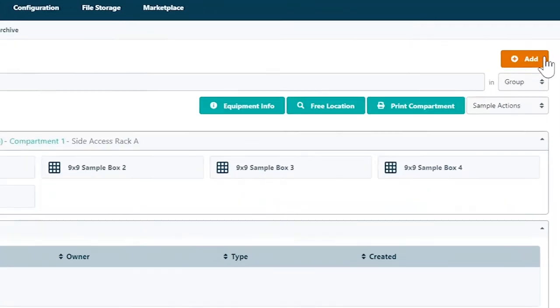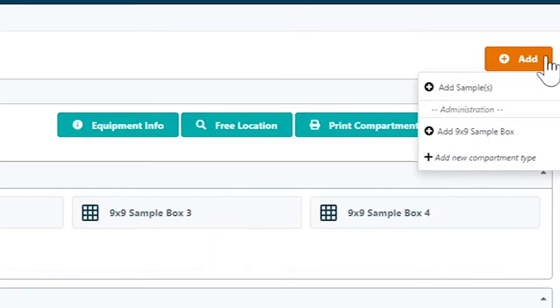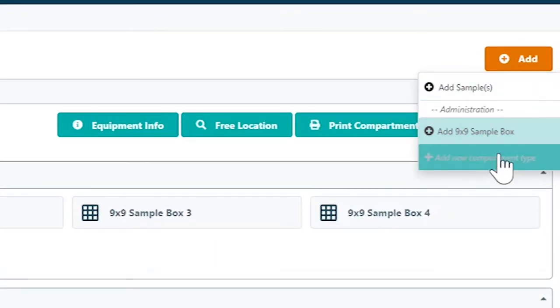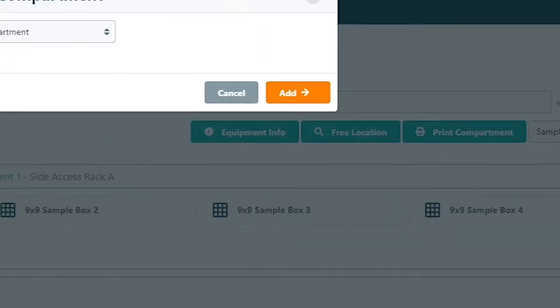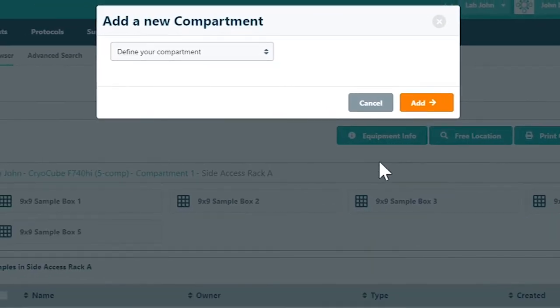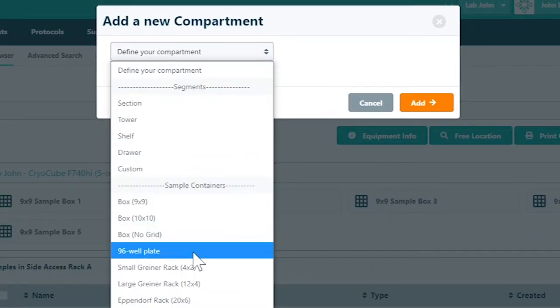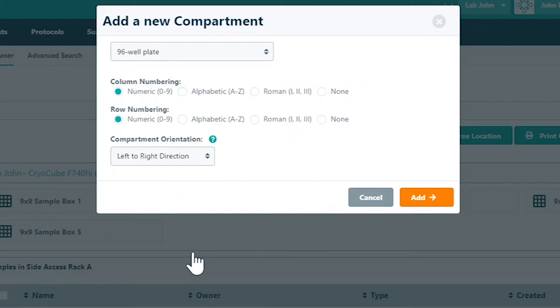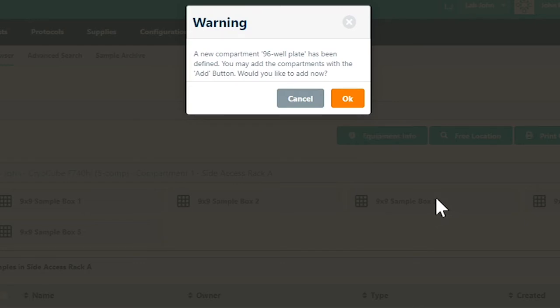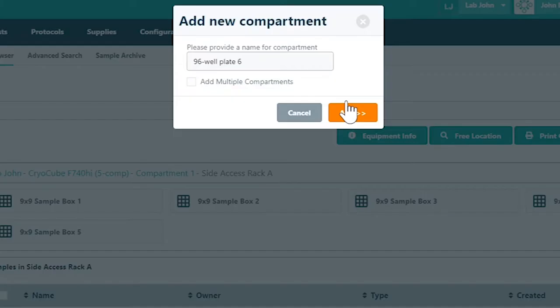To add a new type of compartment such as a 96 well plate, just click the add new compartment type menu option. You only need to add a custom compartment once. Once added, you can find this new compartment type as a new option in the drop down menu which is available when adding a compartment.